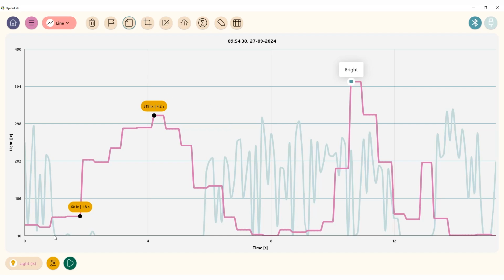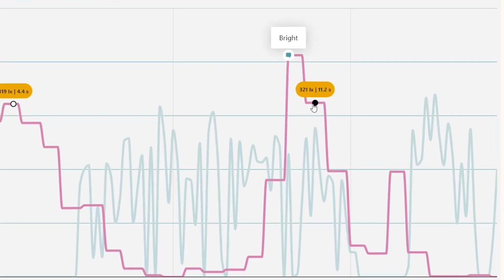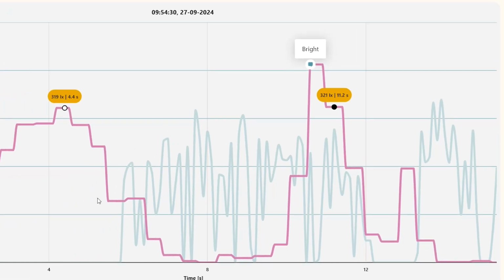Now, if I were to do that right now with only 2 movable markers in my scene, these markers would jump from their current graph onto the newly selected one. If I want them to stay put on this specific graph, I need to make sure I lock them before switching which graph is my primary graph. To show that, I will add a movable marker over here, and you'll see that it jumps down to the other graph when I select that sensor.